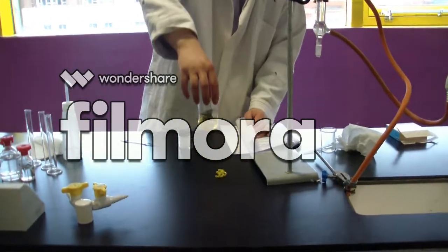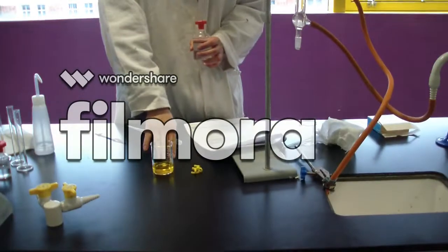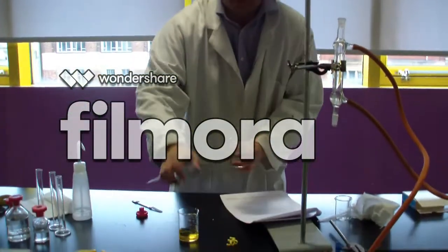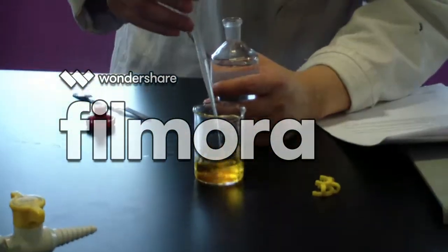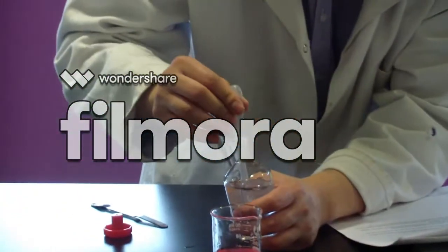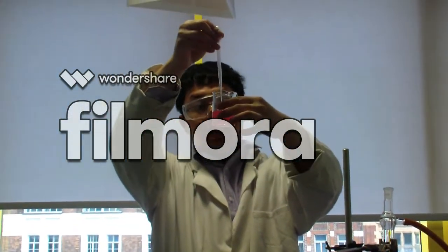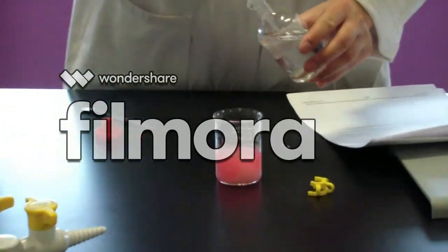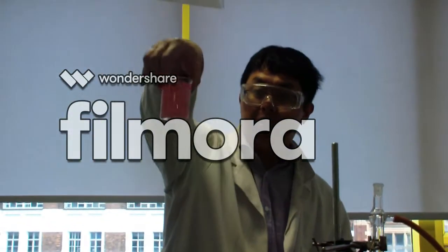As you can see, it's a yellow color because of the sodium hydroxide. And now we add HCl in order to turn the sodium benzoate into benzoic acid. The methyl orange helps you see the color change as we do this. As you can see, it's slowly turning red, and then pink. You can see that it's becoming cloudy, which is the precipitate form of benzoic acid. It doesn't matter how much HCl you add. There you go. You can see the white precipitate.